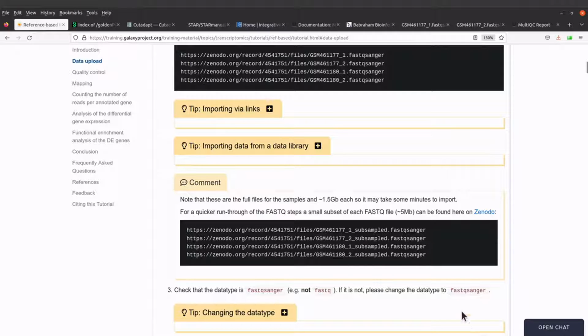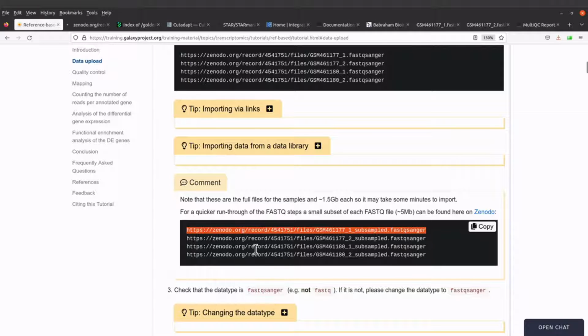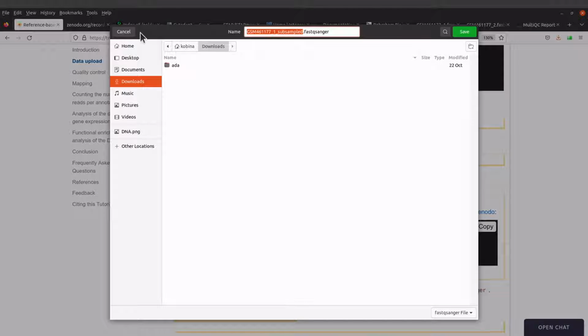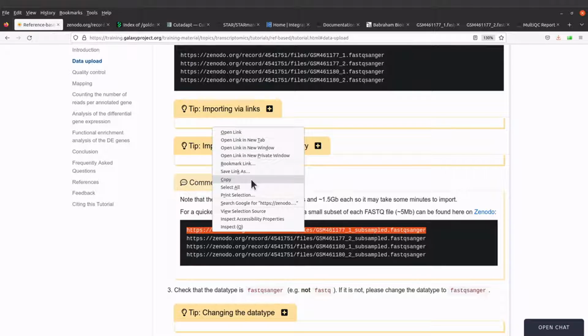So let's proceed. So we have fastq files here. These are paired-end reads. There are two samples here, but I'll use one sample. So that means I'll use this and then this. So that's what you're going to do. You can download by highlighting and then clicking it. If you do that, you'll be asked to save the file. You can do it this way, but I want to download using my terminal, so I'll just get a download link. I'll start with the first one here, which is the forward sequence.